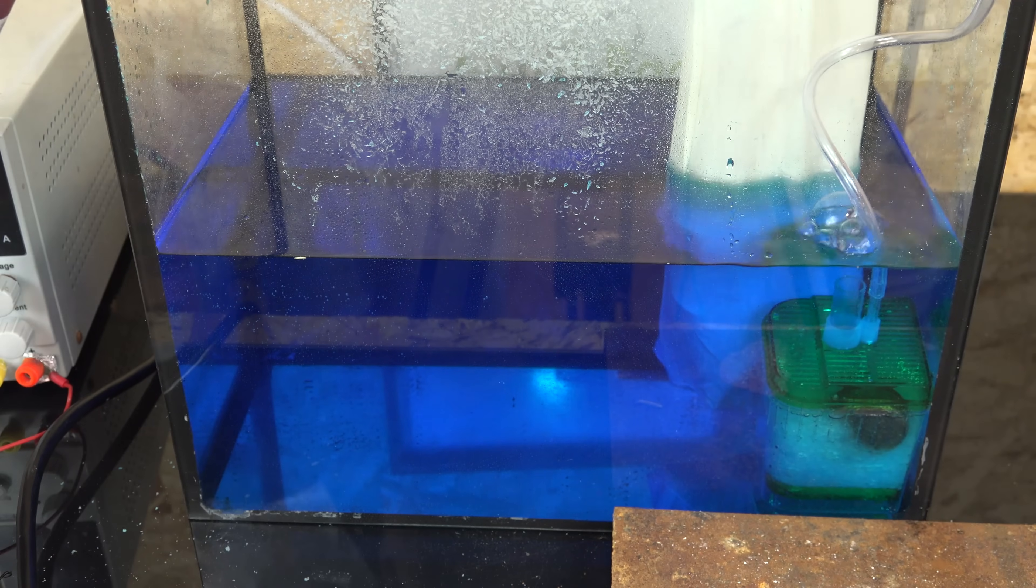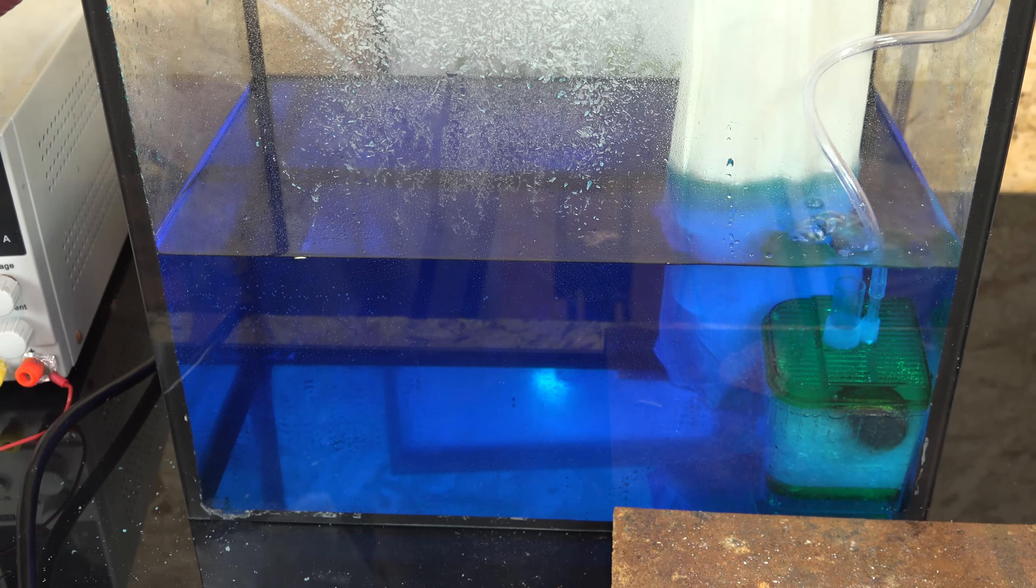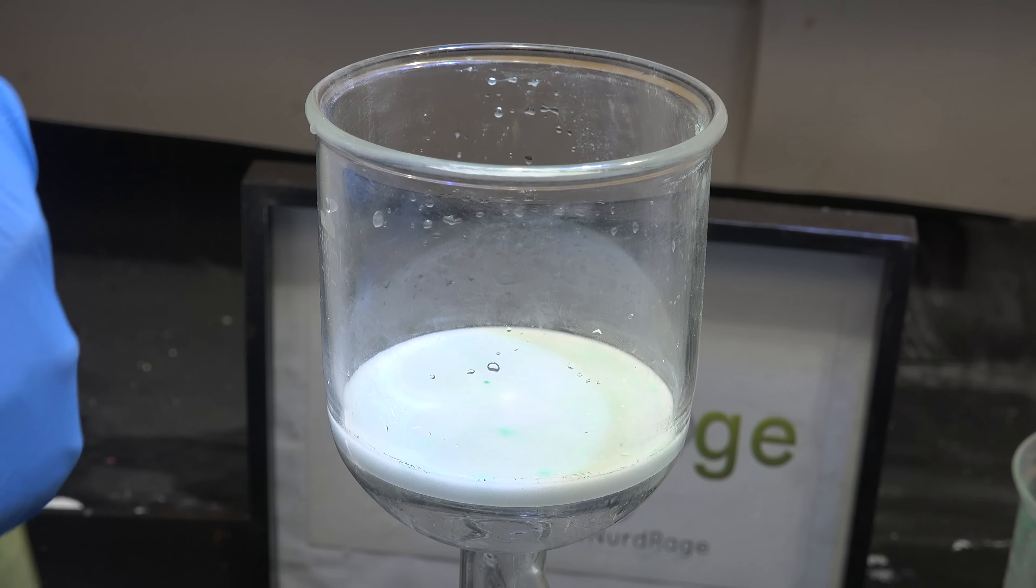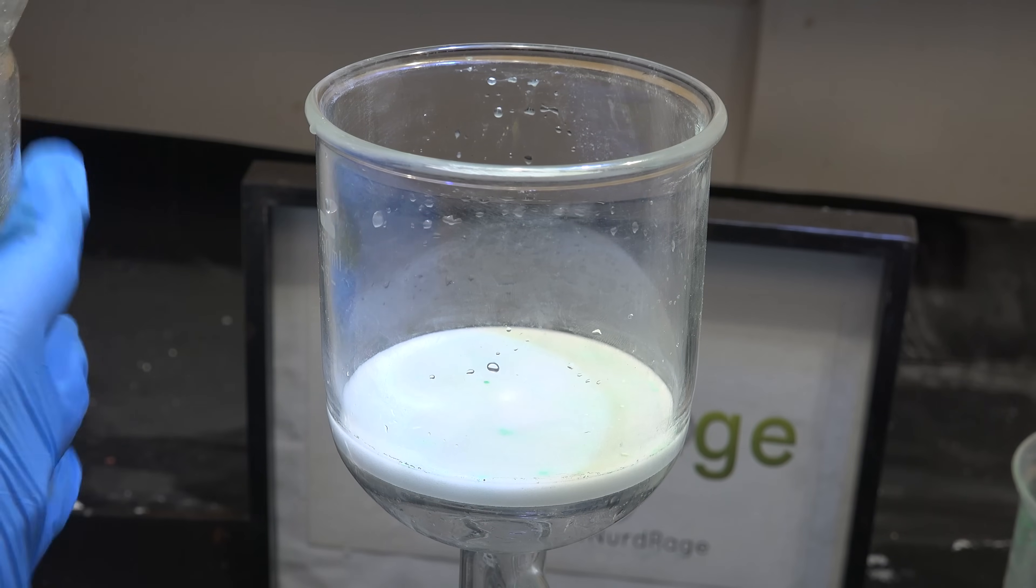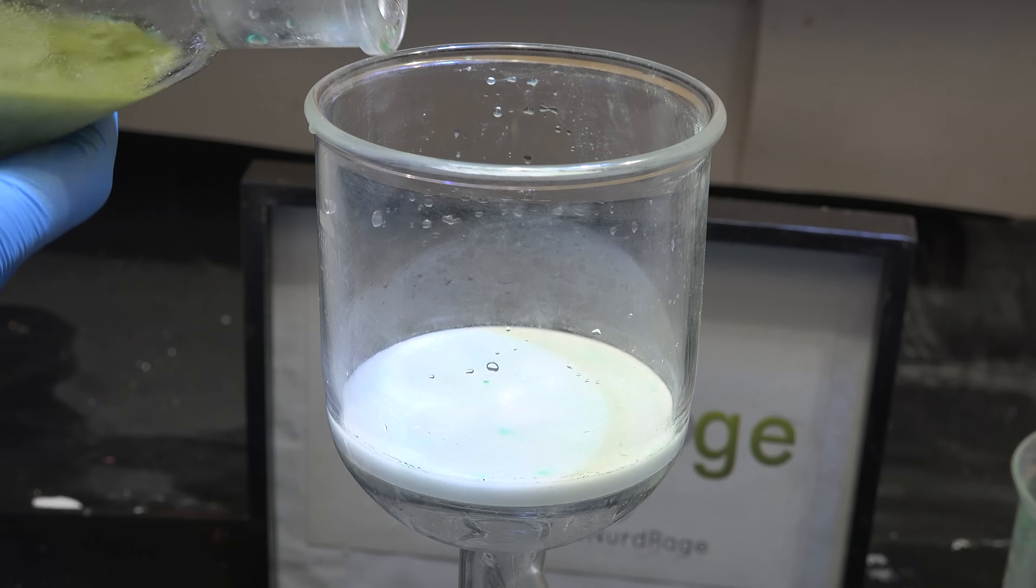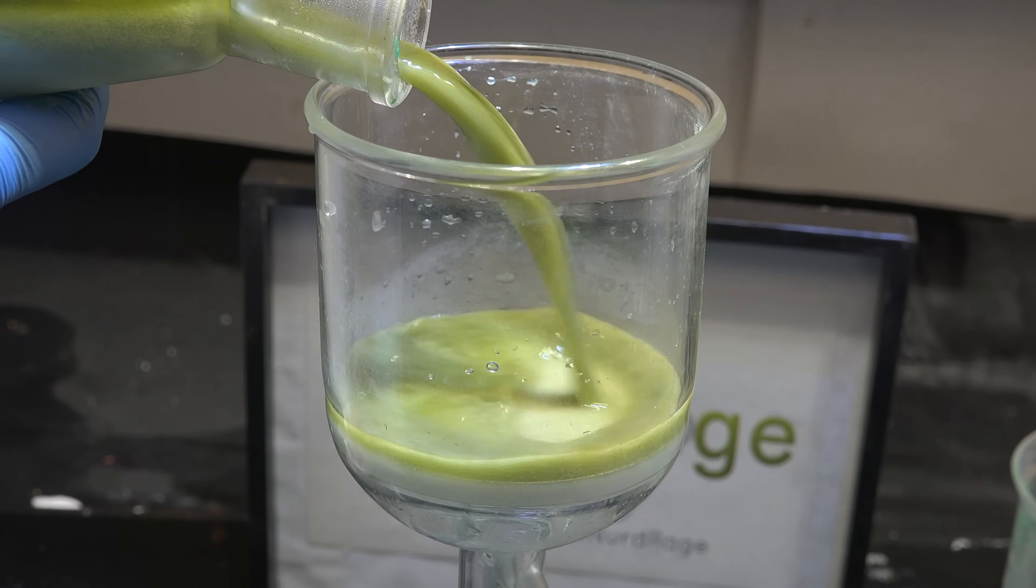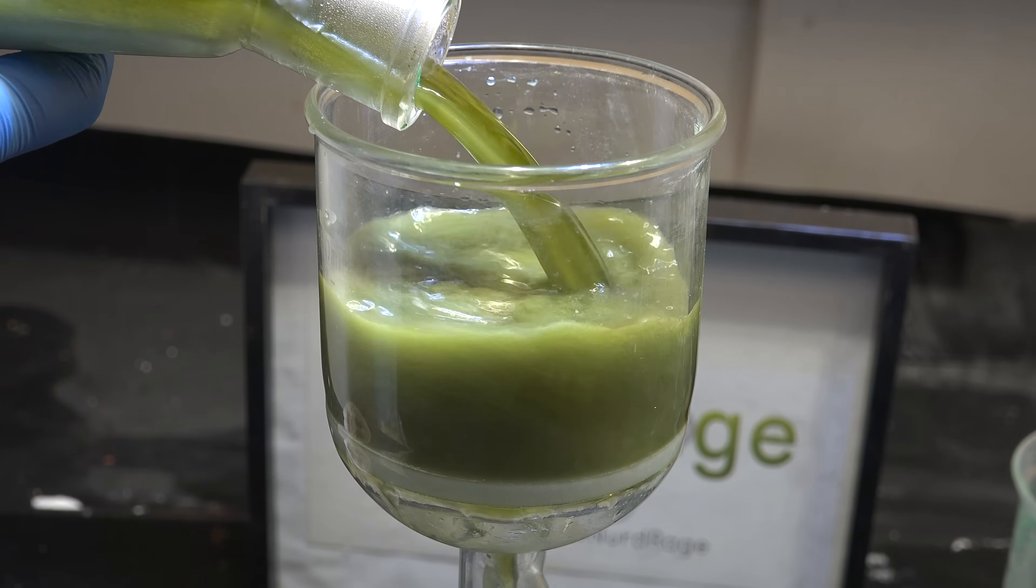Drain cleaner is the most common, but if you can't get that then battery acid is another. And you can even make sulfuric acid using various processes that we've already demonstrated on this channel, like the copper chloride process or the electrobromine process.